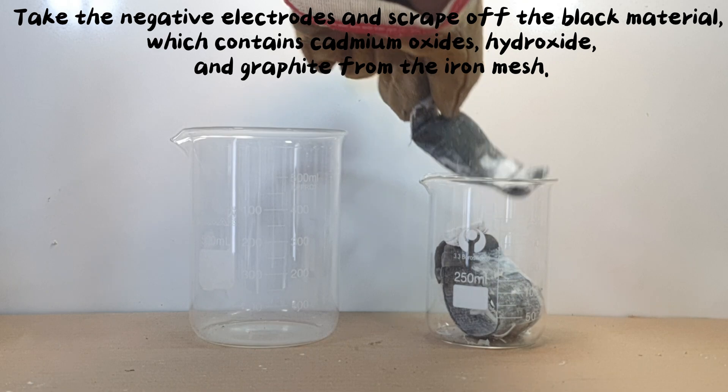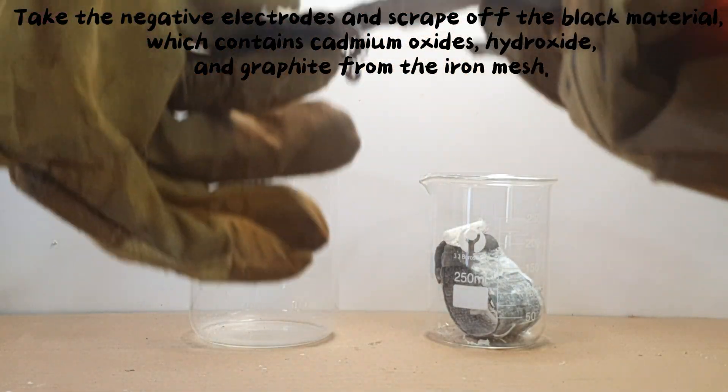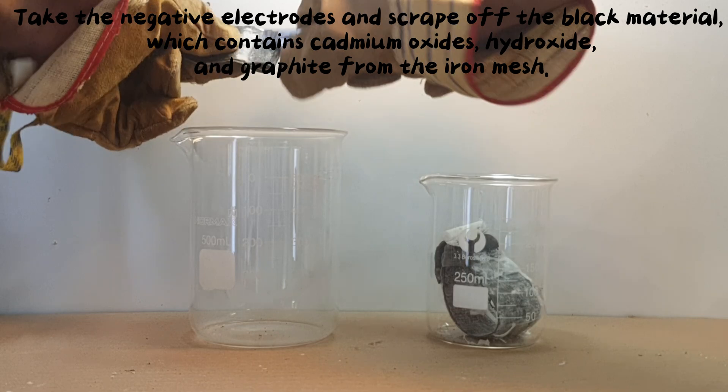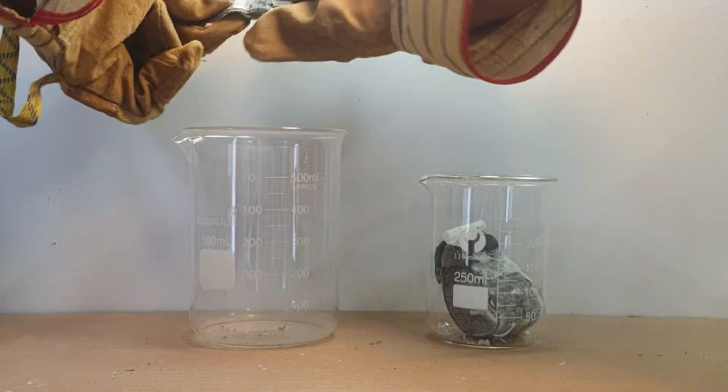Take the negative electrodes and scrape off the black material, which contains cadmium oxides, hydroxide and graphite from the iron mesh.